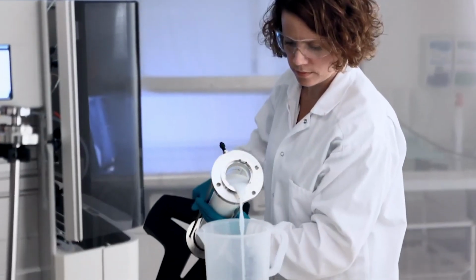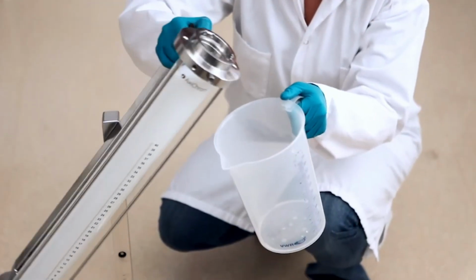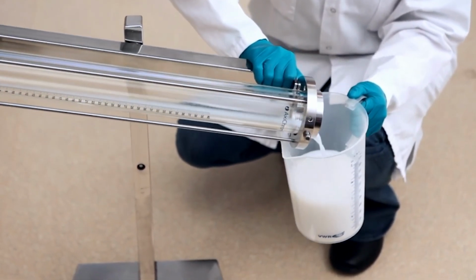The slurry can be poured out by simply lifting and tilting the column to the side. Alternatively, if the column is attached to the pivot stand, it can be tilted to empty. The pivot stand also simplifies changing the bed support.